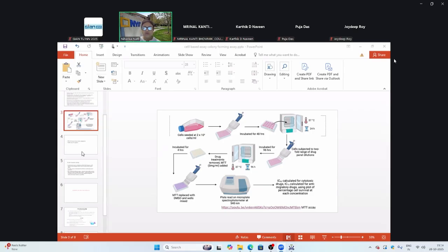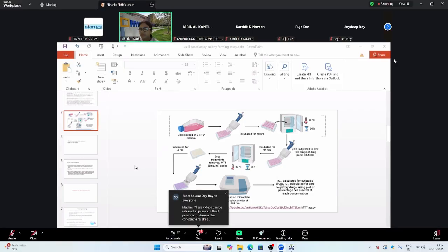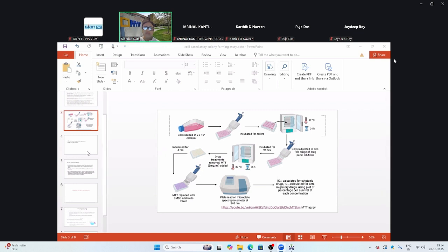Alrighty. So, there was just a lot of information in there. I just wanted you to see the lab environment and how things work. This one gives you an idea of how cell apoptosis is visualized under the microscope. Most of these techniques are based either on fluorescence microscopy from tissue culture or simple staining so far. So I think that's where I would like to end.